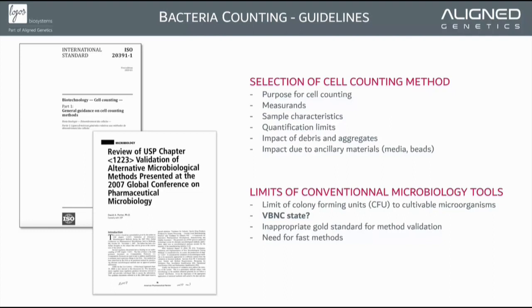named viable but non-culturable, VBNC, raises concerns about the standard method for the enumeration of viable bacteria. Of course, depending on your field of interest, VBNC can be more or less critical. But imagine you develop an antimicrobial treatment and you monitor the cultivability of the targeted bacteria by counting CFUs. You could obtain wrong data about the effectiveness of the treatment. Even worse, as the VBNC state is not permanent, those bacteria can resuscitate in favorable conditions.